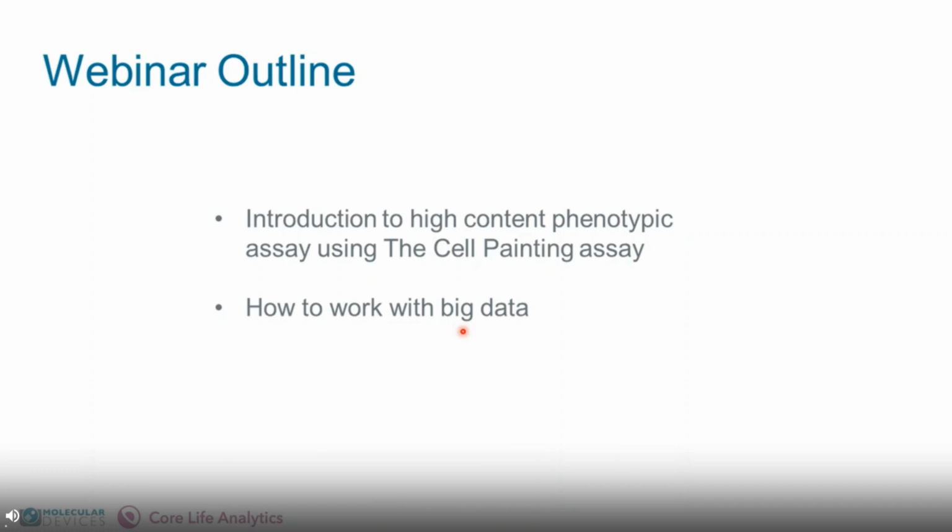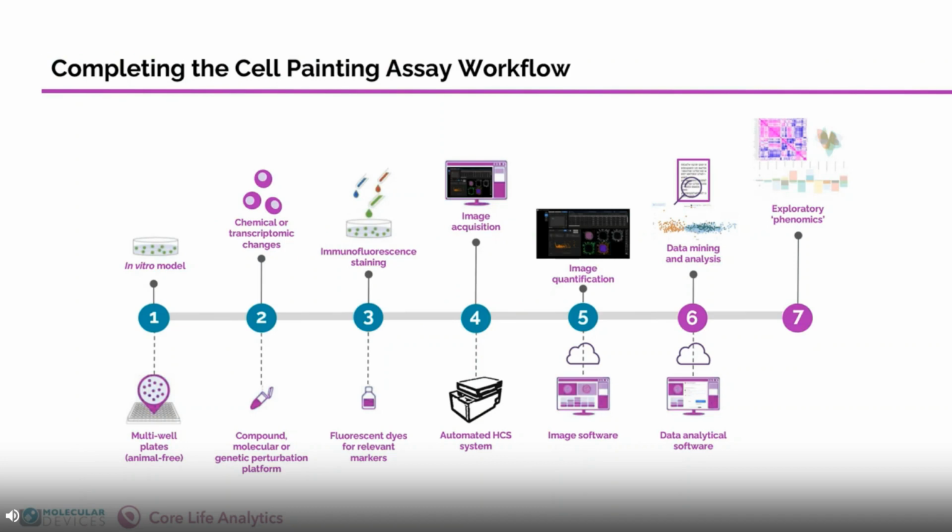It will not be heavy on the technical aspects, but rather the emphasis is really more on the fundamentals of analyzing and playing with the data at the end of the workflow that Angeline showed earlier. Essentially, how do we get from acquiring these beautiful images from steps 1 to 5 to the finish line at steps 6 to 7 with new, meaningful biological knowledge?